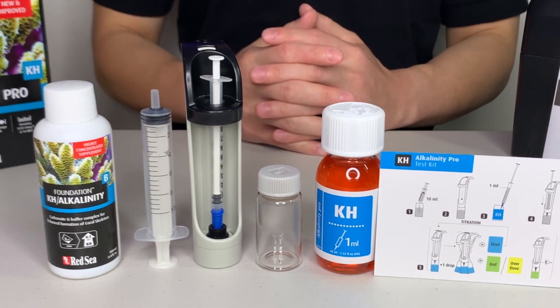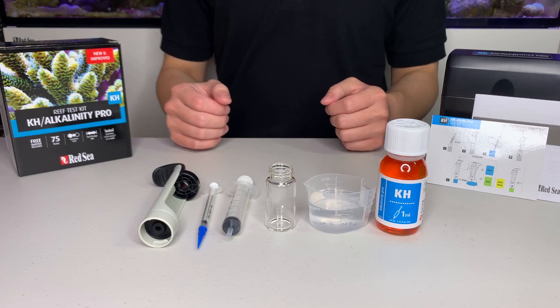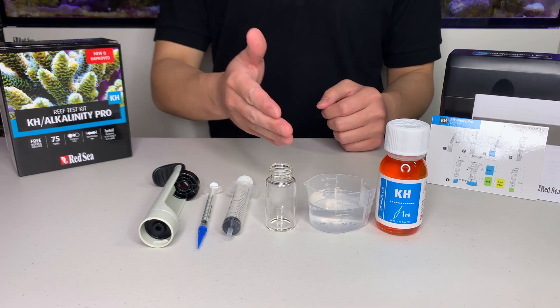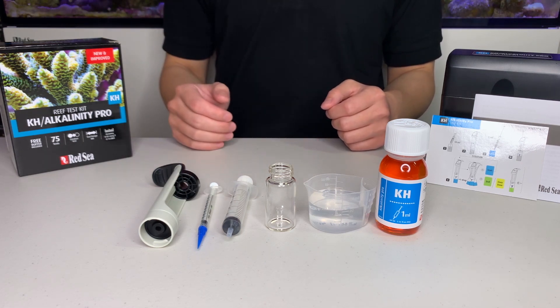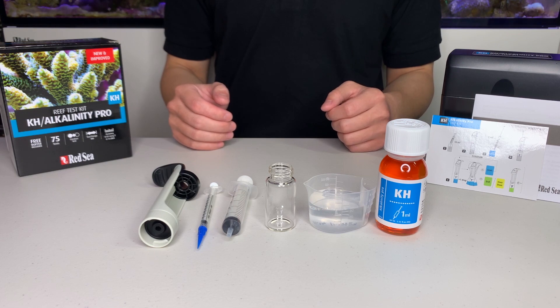Here's what comes in the box. Before we start the test, I have prepared a sample of water from my aquarium and I've washed and dried all my syringes and vials, so we are ready to go.